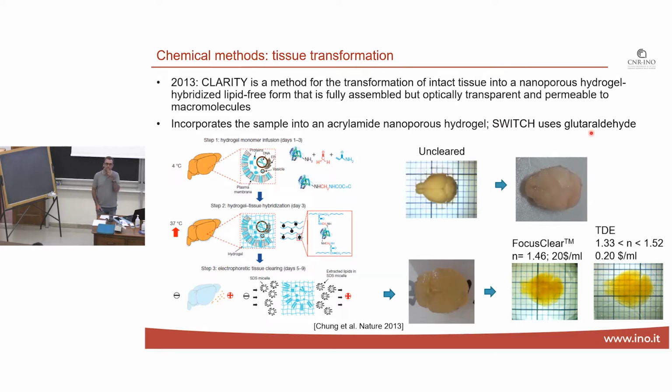But one nice thing to know is that these hydrogels are permeable. They have nanopores, and so these clearing techniques are compatible with custom staining protocols, because as I will show you in a couple of slides.